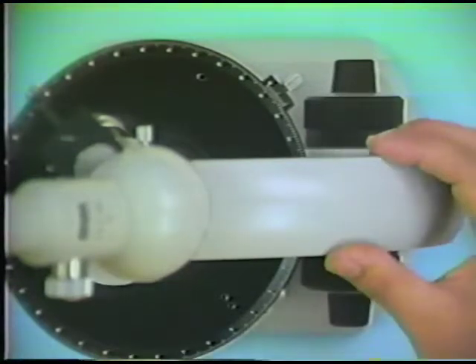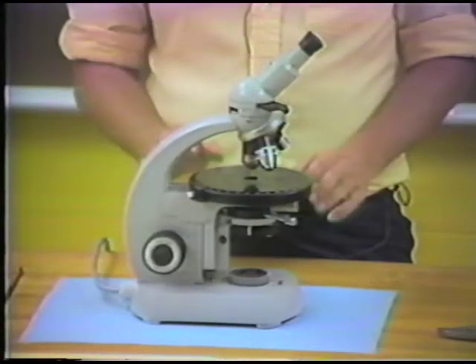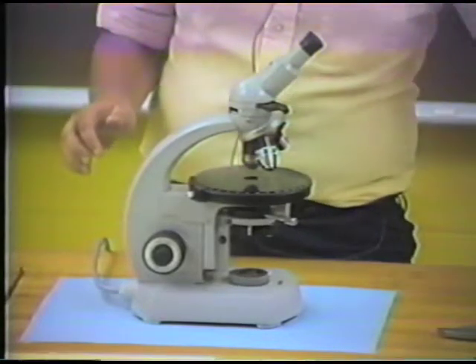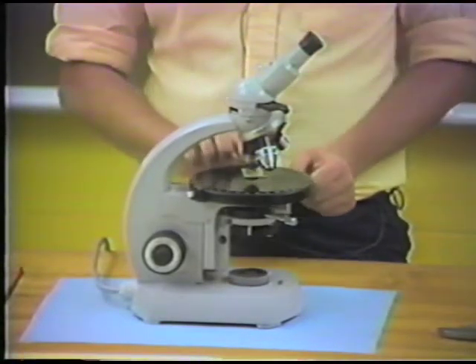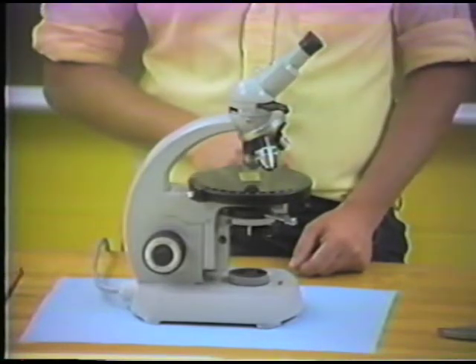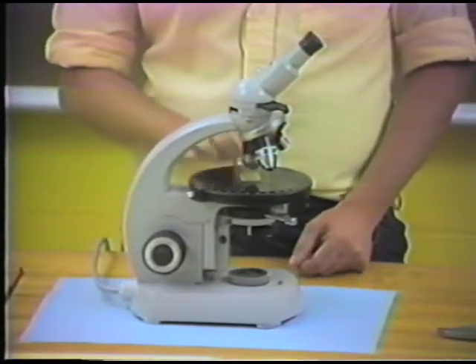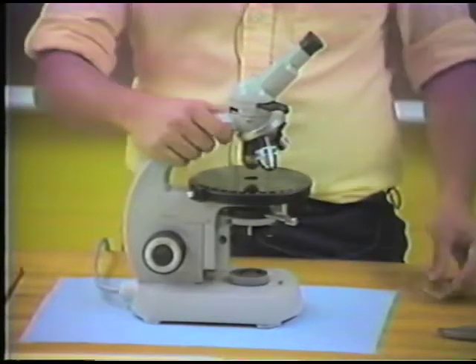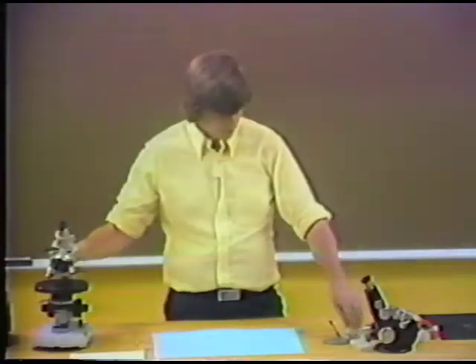Now, a lot of times we use the stage directly. We can put the specimen directly over the hole that occurs in the center of the stage and look at the specimen this way. But we also have special devices that help us orient a specimen. Now I'll show you one of these.